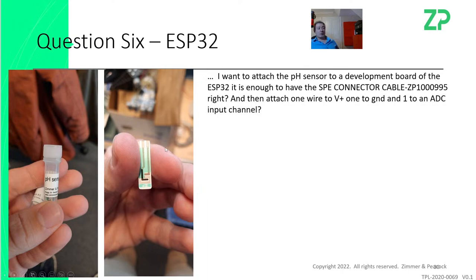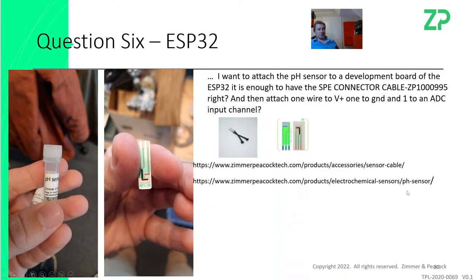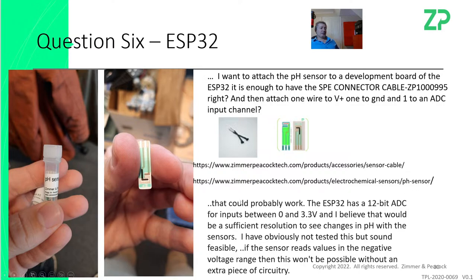We haven't measured a pH electrode on an ESP32. We have not done it, but he's got one of our cables, so we took a look at the cable, we took a look at the sensor, we do understand that. And the answer back, I literally just copied and pasted it: that probably would work. He's rationalized it because you have a 12-bit A to D converter, and therefore he thinks you've got sufficient resolution to be able to measure the pH. We have not tested it. This is not something that we support. We're just doing this as part of community support to say, we think it could work, but you have to do it. It's not something that we do, but it sounds feasible.